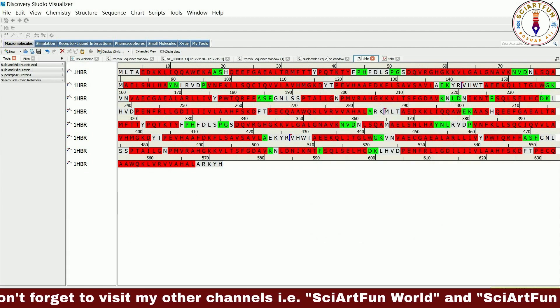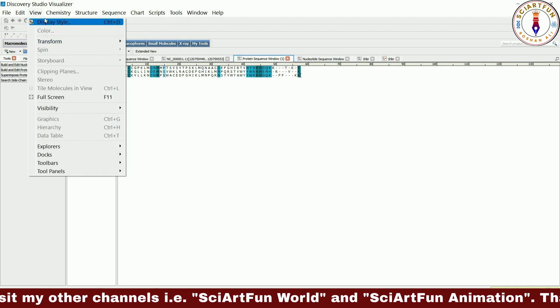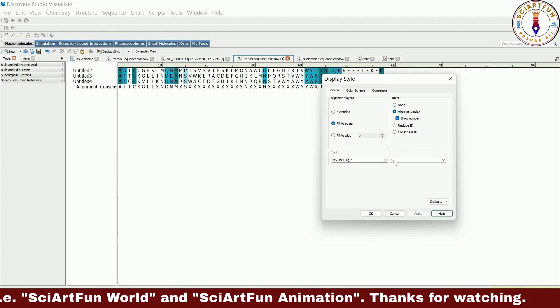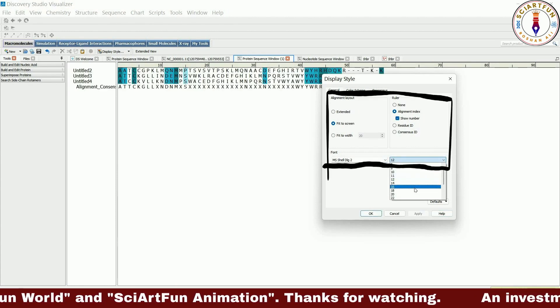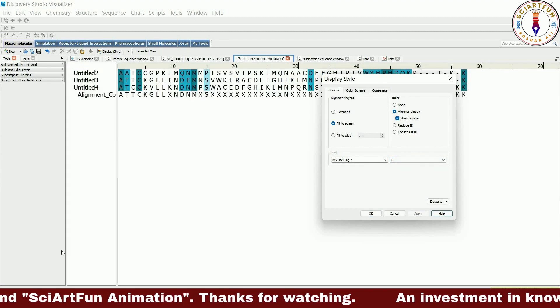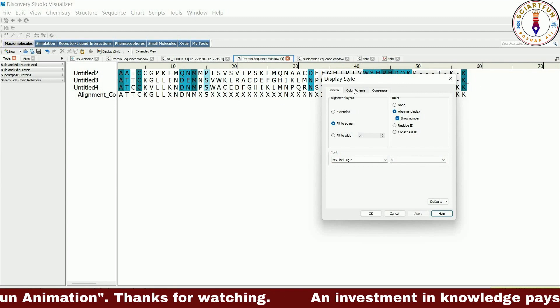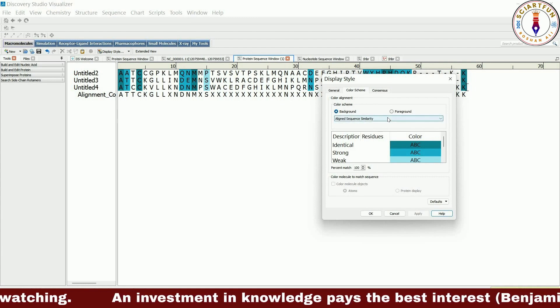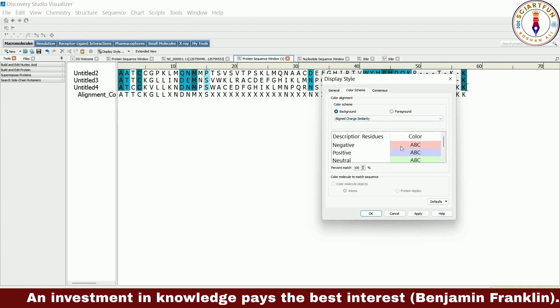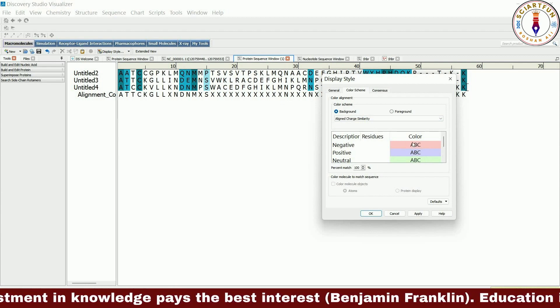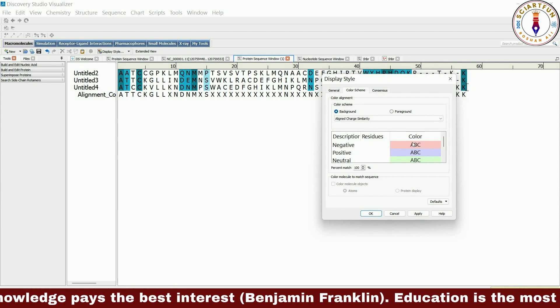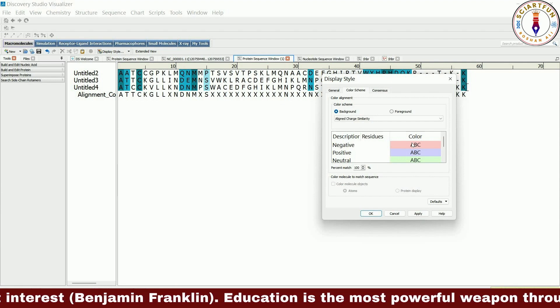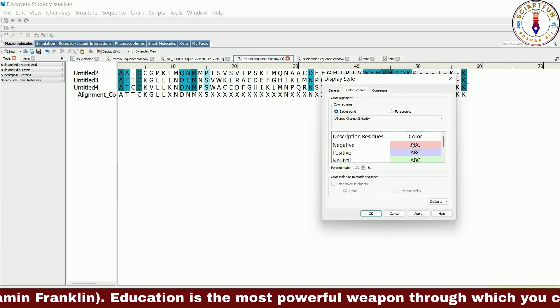Now let's go to a multiple sequence alignment window and open the display style dialog box. Let's increase the size for visibility. Now let's learn the use of the color scheme for alignment, which will be of great help in analyzing multiple sequence alignment. The first option, aligned charge similarity, gives colors on the basis of charge similarity. Negatively charged residues will be colored pink, positively charged residues will be colored blue, and neutral will be colored green, while those not matching will remain colorless.